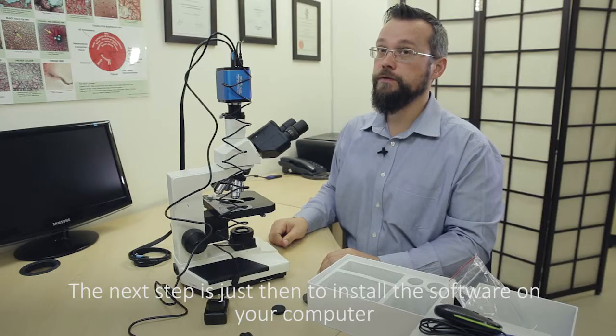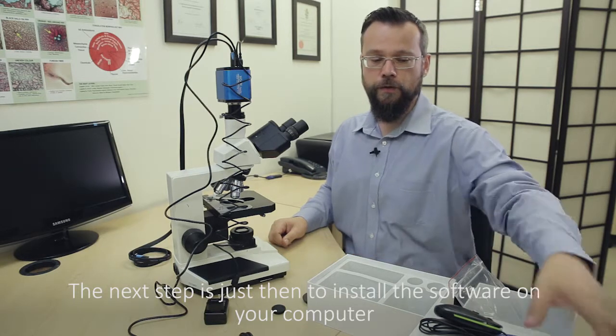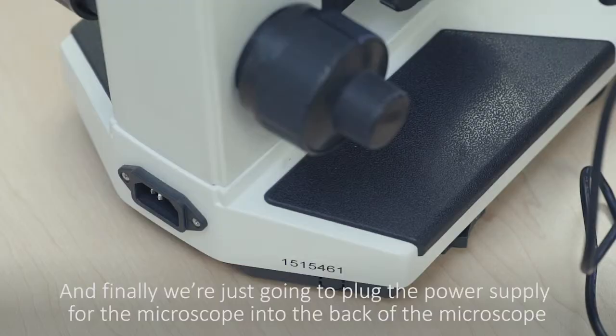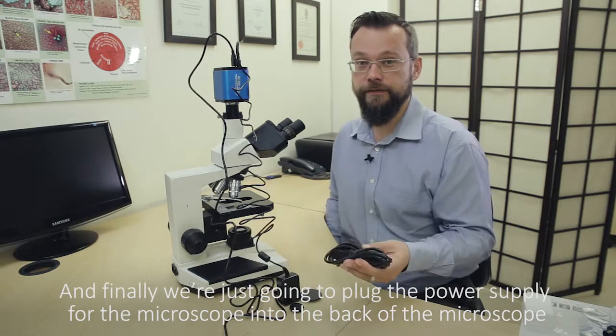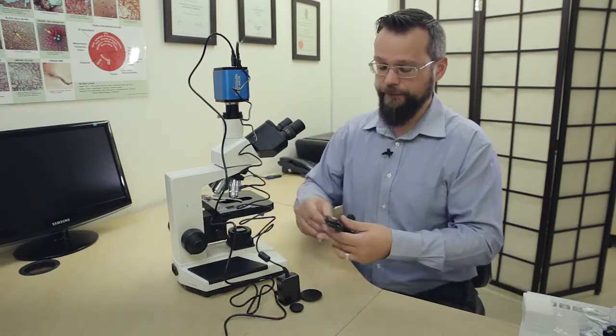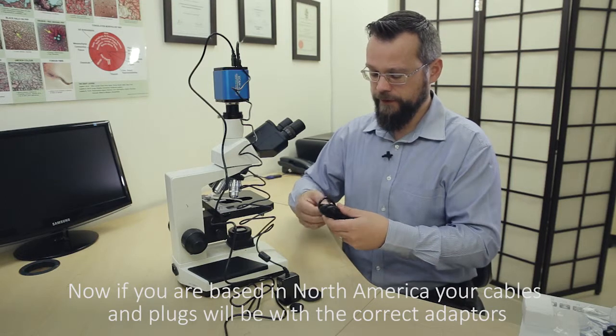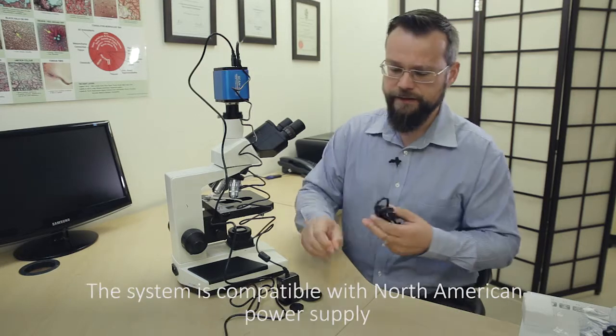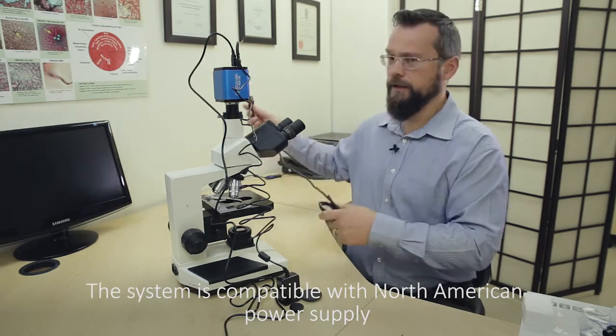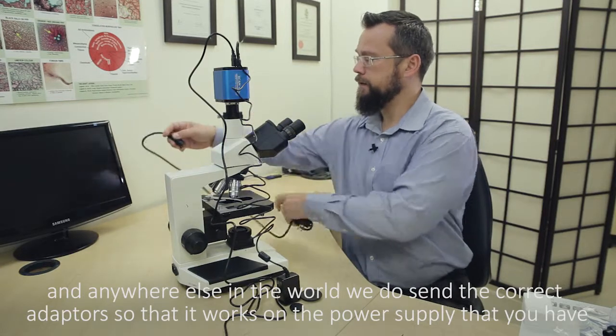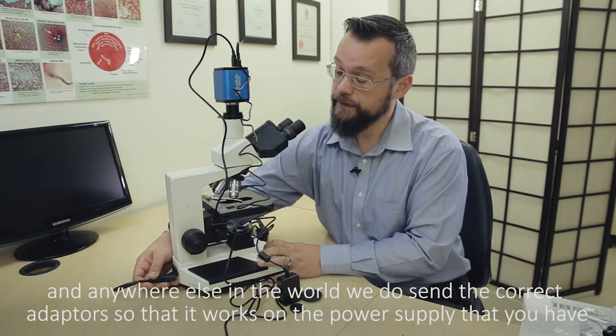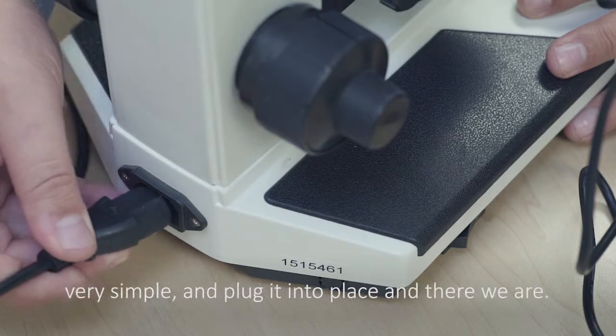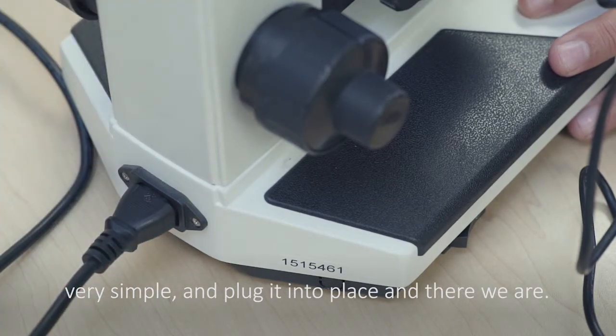The next step is just then to install the software on your computer with the disk that's provided with the camera. Okay, and finally we're just going to plug the power supply for the microscope into the back of the microscope. Now if you are based in North America, your cables and plugs will be with the correct adapters. The system is compatible with North American power supply and anywhere else in the world we do send the correct adapters so that it works on the power supply that you have. So this really just fits into the back of the microscope. They're very simple and plug it into place, and there we are.